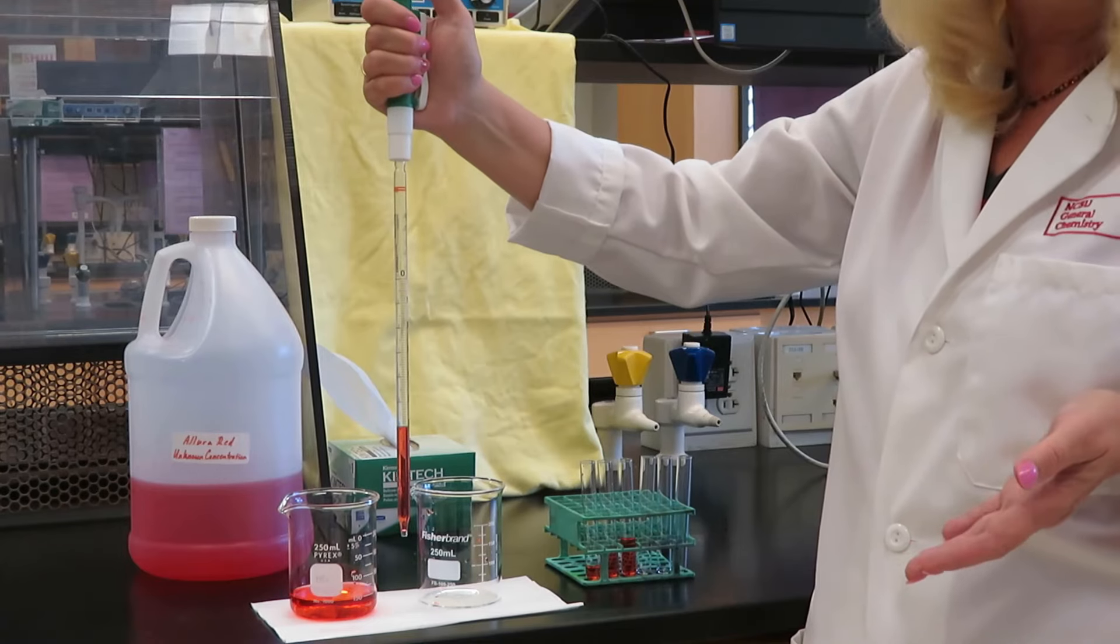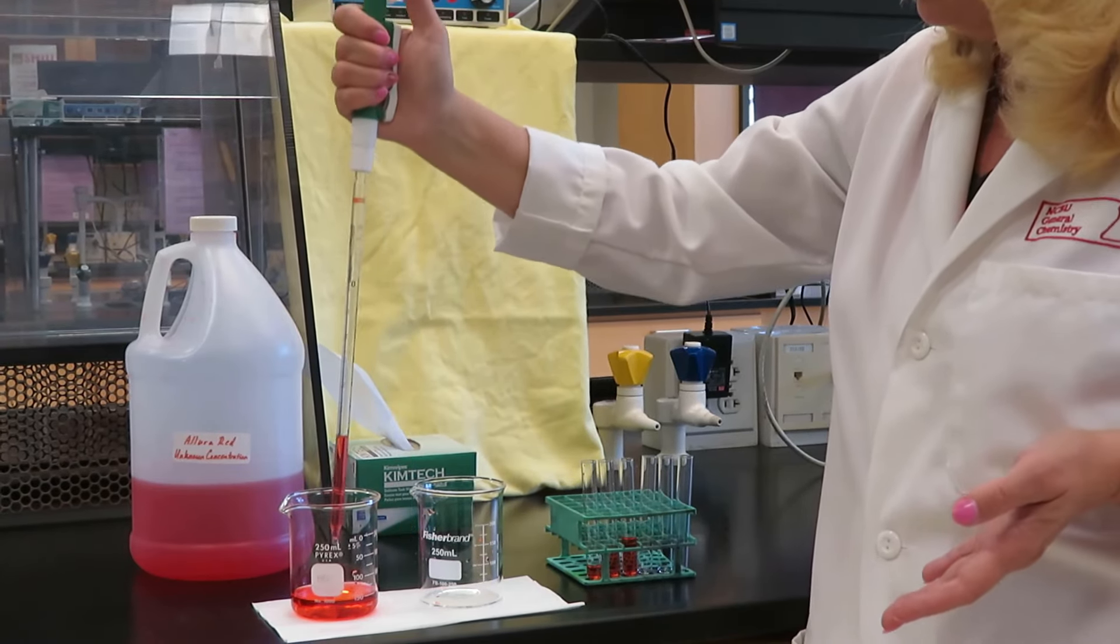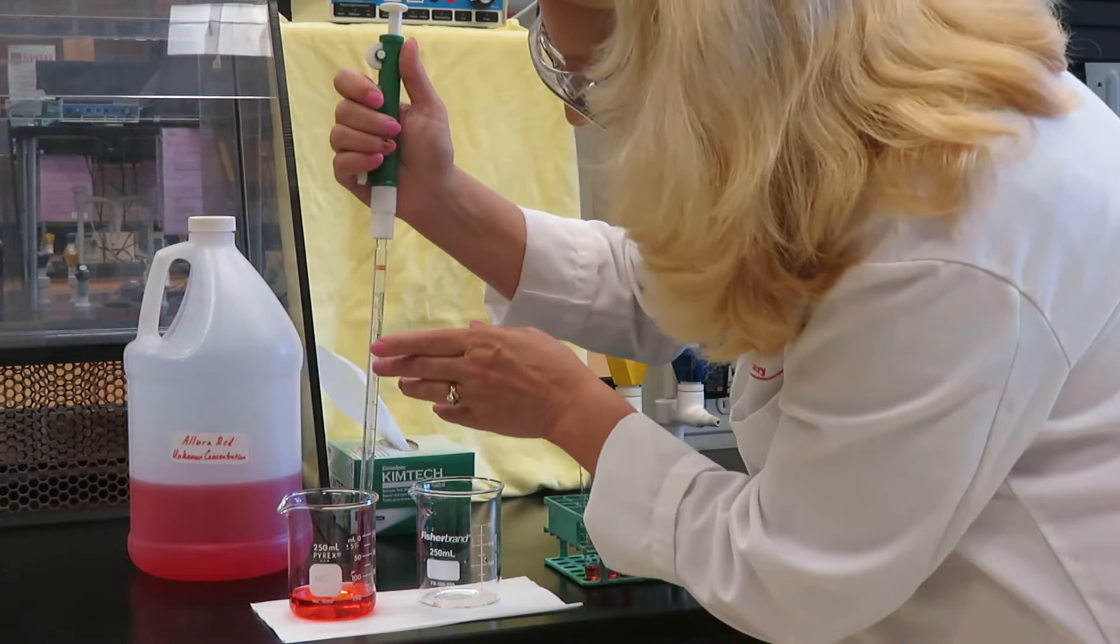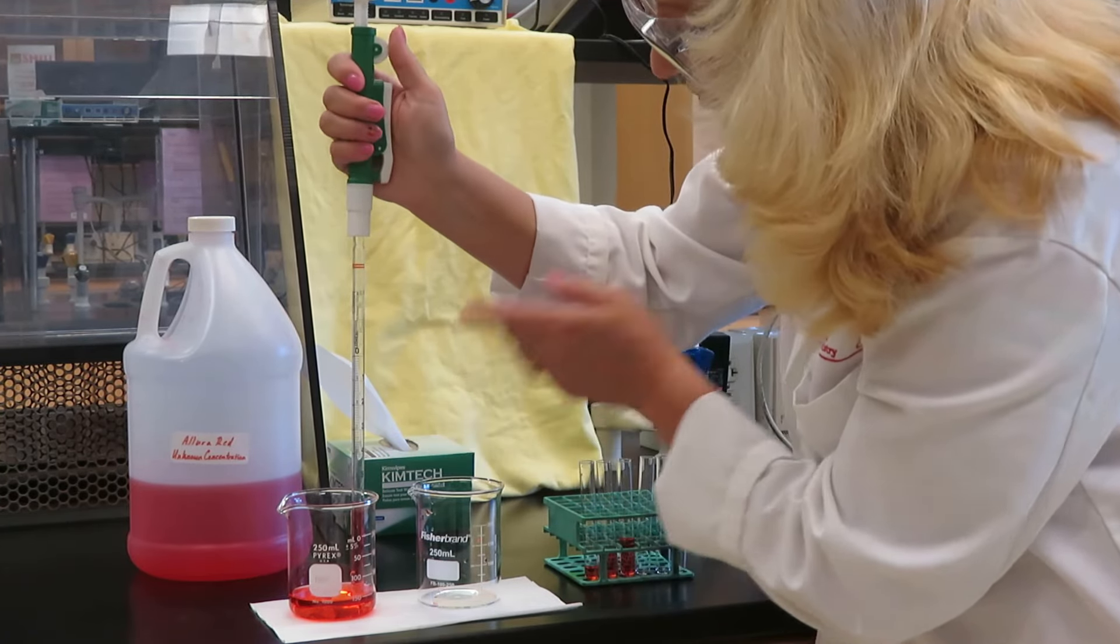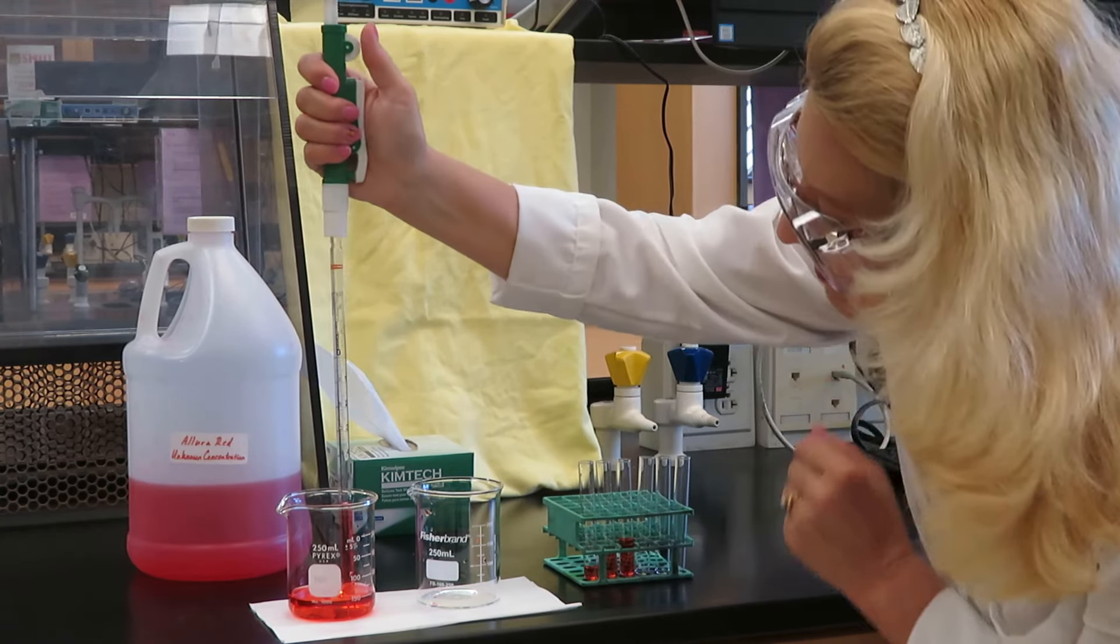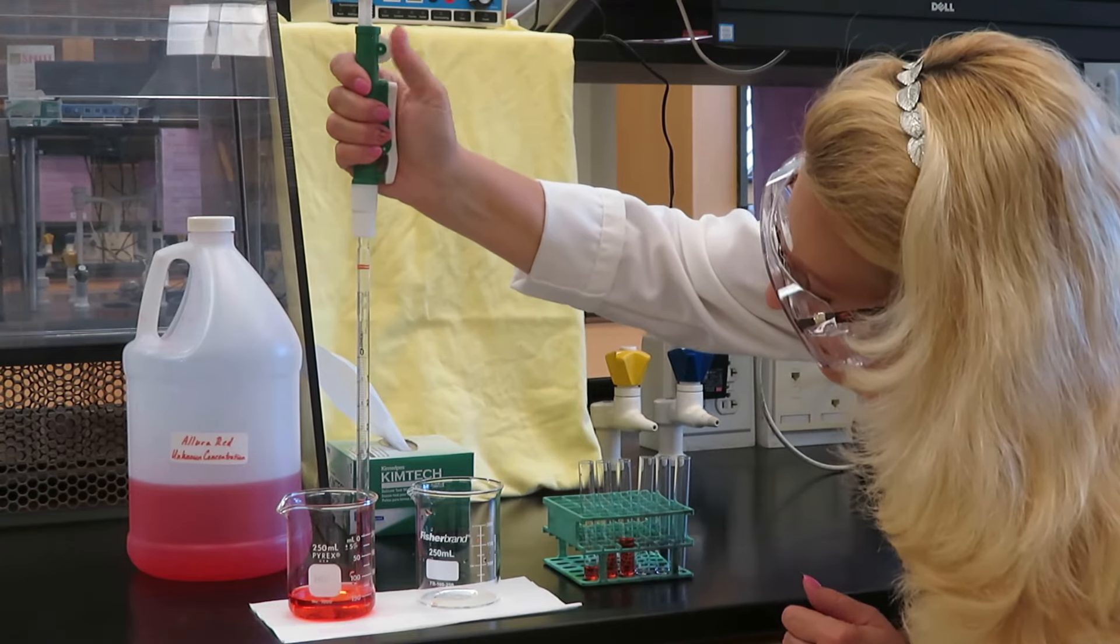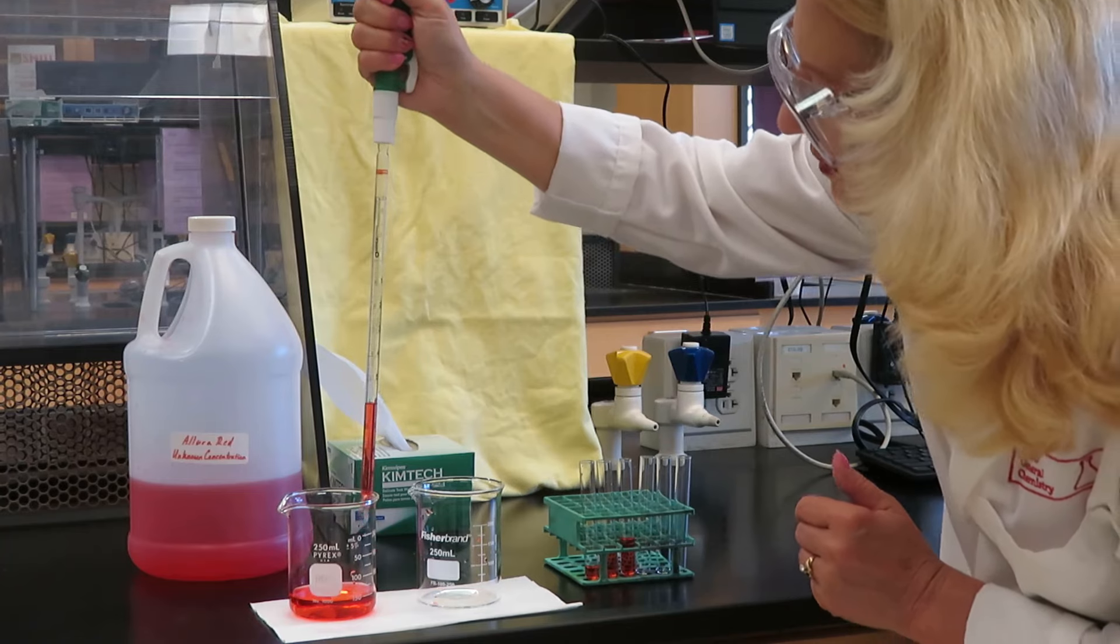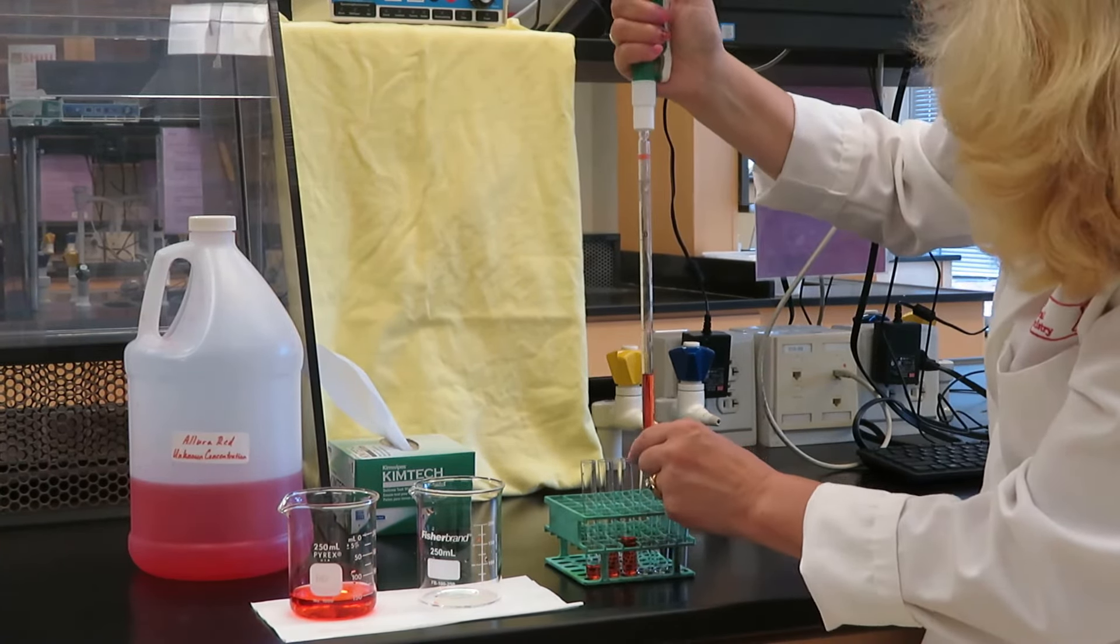Now, let's say in the last test tube, I want 4 milliliters. I'm going to do this one using the graduation on the side, which goes directly at 4 milliliters. So, I'm going to roll downward to draw up my liquid to make sure I am precisely at 4 milliliters at the bottom of the meniscus.